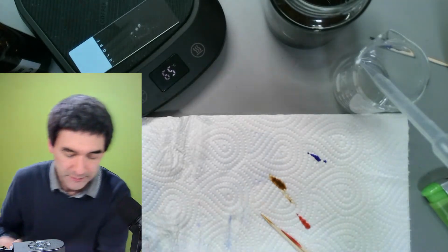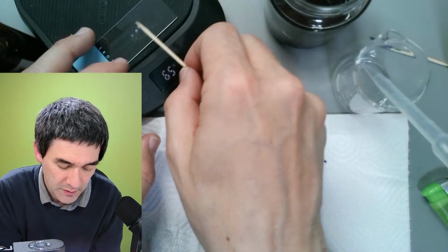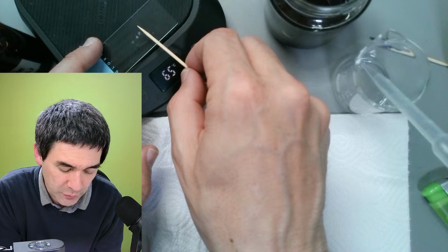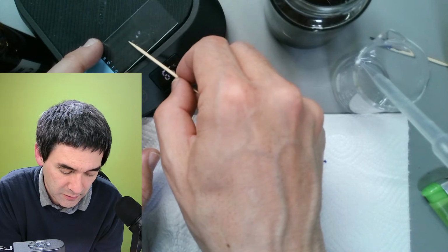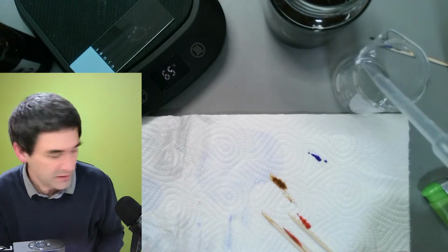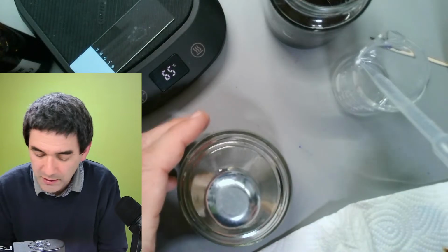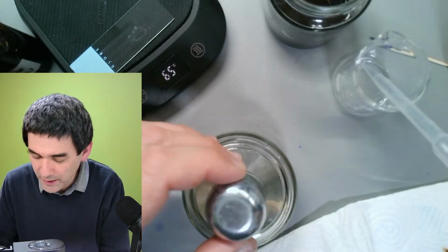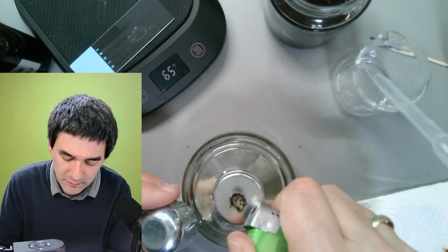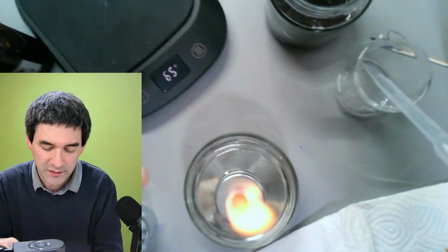Okay. So let's have a look here. Maybe I'm not going to do the complete gram stain here. See, it's already dry. So I'm going to heat fix this. And always, you see, you always have to be careful. Always move burning stuff away. Just make sure that the camera doesn't.